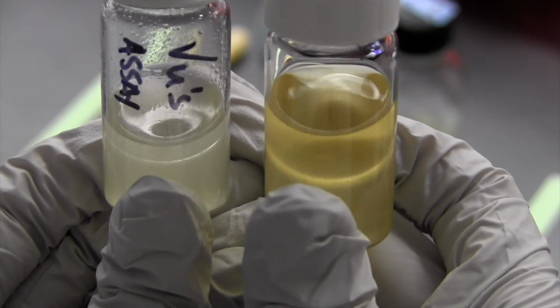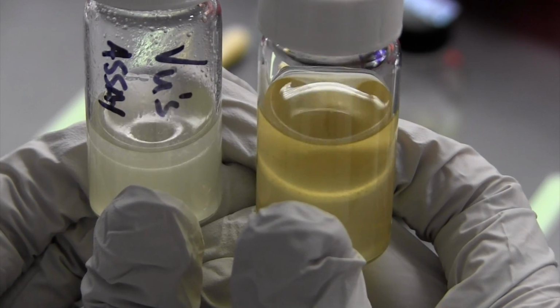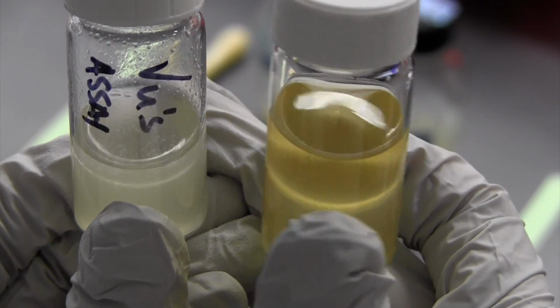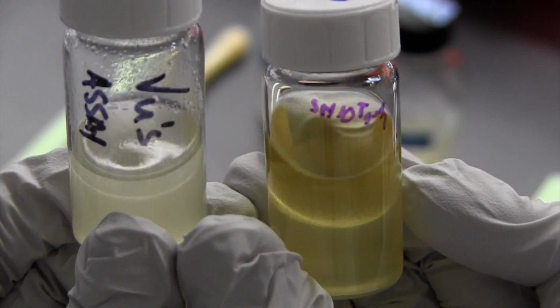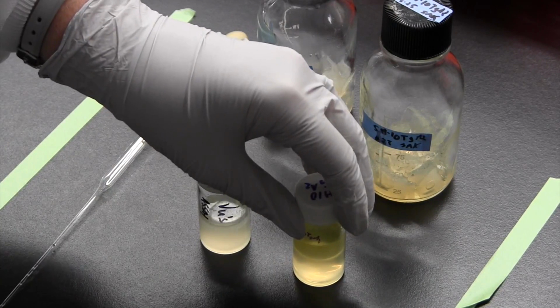a sample where you're not seeing a clear separation of layers, perhaps the easiest thing to do is to put that in the freezer. When you put that in the freezer, your aqueous layer is going to freeze and the organic layer will not, and then you can easily draw that off, and that's what you'll move forward with. So that's a really easy way to troubleshoot not getting really clear, distinct layers for your chemical extraction.